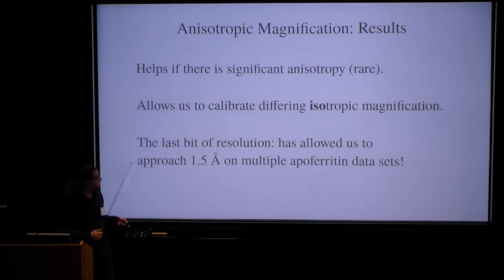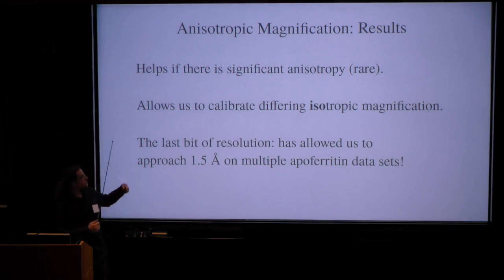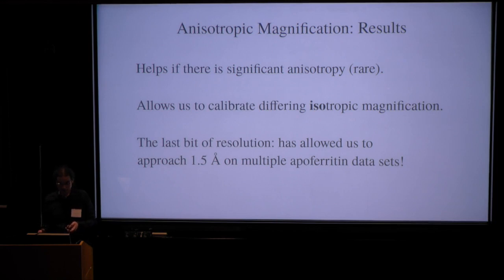And finally, it's the last thing that one can do. It usually produces a small improvement, because there usually is some little bit of anisotropy. So with this together, we can now approach the highest resolutions that we've measured so far. Well, reach.